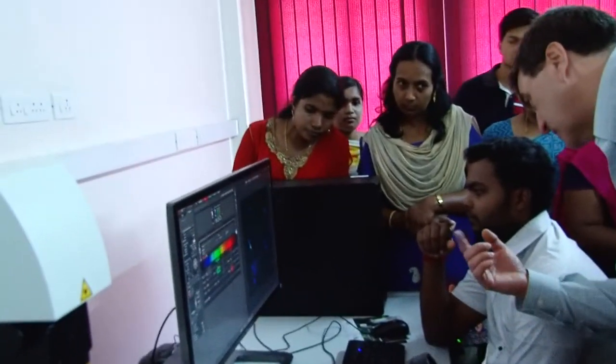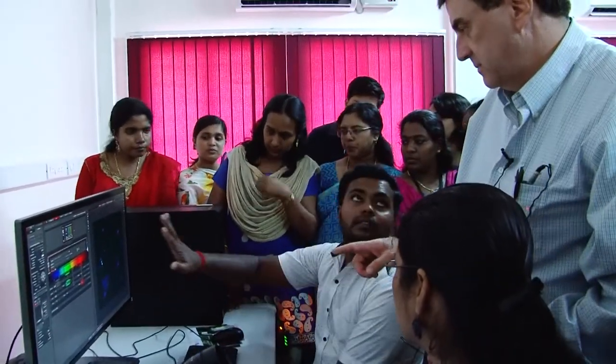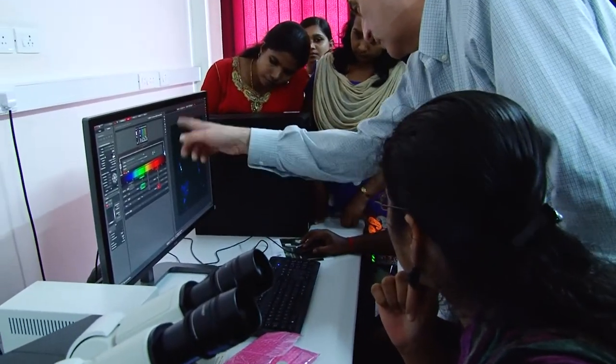Okay, so she's got something here. Can we take a Z, start at the top, have her pick a top and then a step? Okay. The laser's fine, no? The incident laser, turn it up just a little bit. It won't hurt anything on these. You can go up a little higher.